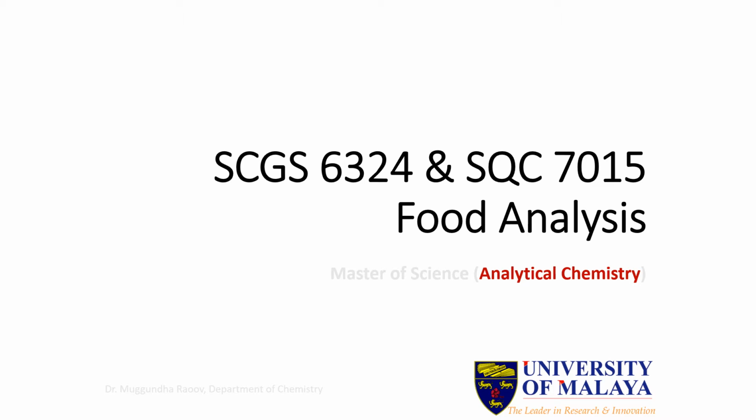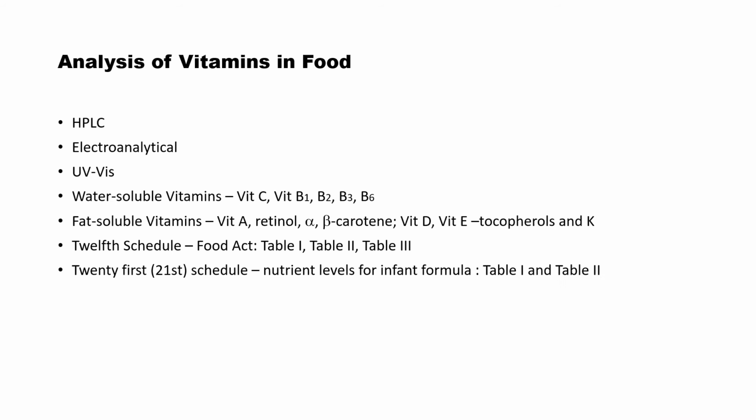Very good evening, class. So today we are going to learn about the analysis of vitamins in food. Last week we focused more on the introduction of vitamins. So this week we are going to learn the methods to analyze the vitamins in food samples. There are a few methods that are available in the market.